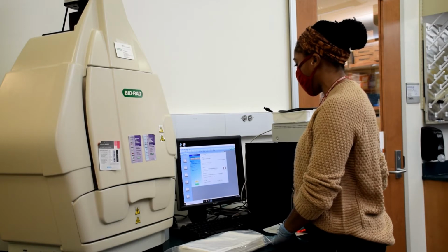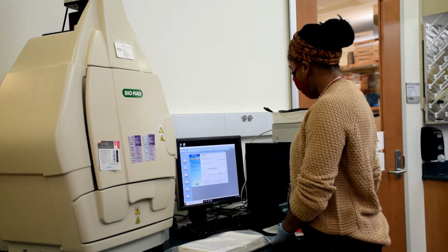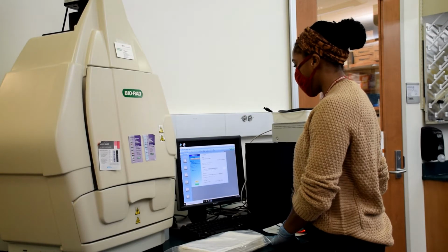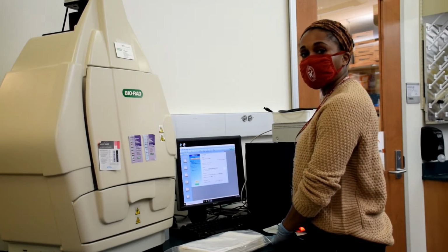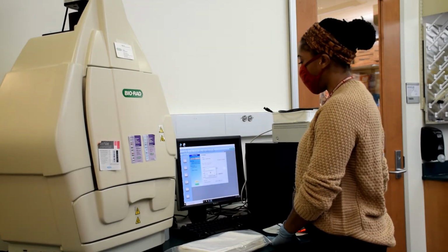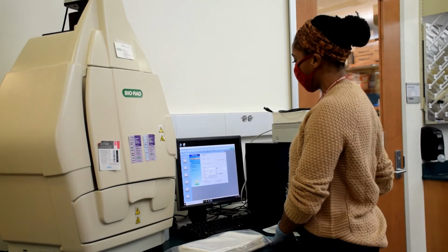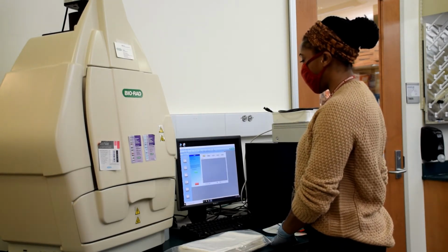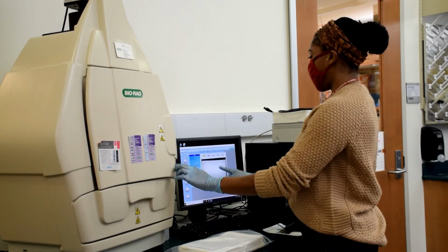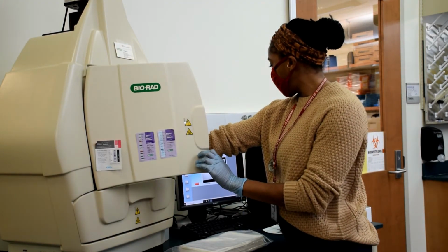of the filter paper. I know that it is 28 by 21. So it has the full scope of the paper. Set the exposure time to 0.5 seconds, so it's pretty quick. And now I'm going to position the gel, and also the computer makes me know that I have it on the right filter. I have filter 1, so I say okay. Now it shows me what the filter paper looks like in the imager. It has a nice grid pattern. So now I'm going to open the door and readjust it so it sits perfectly in the center.